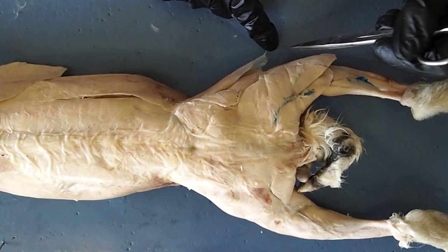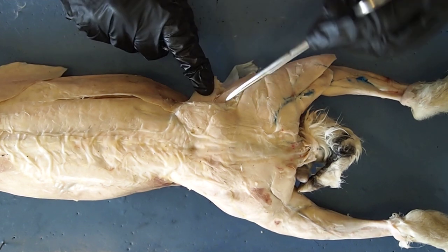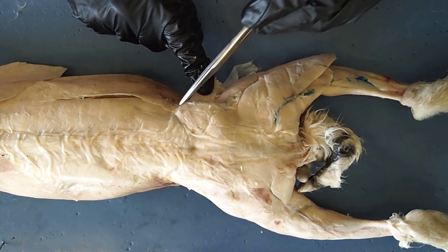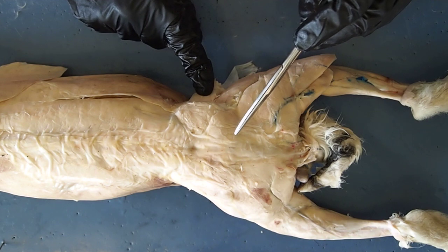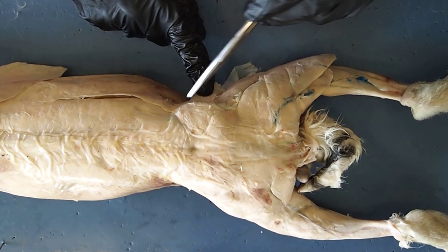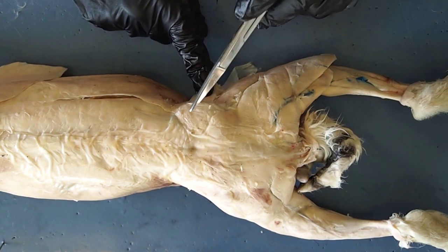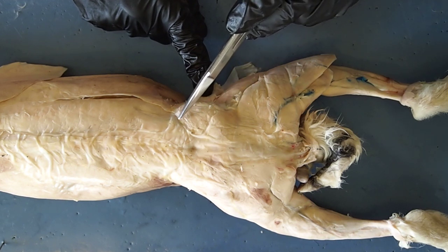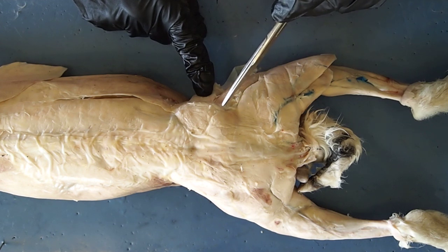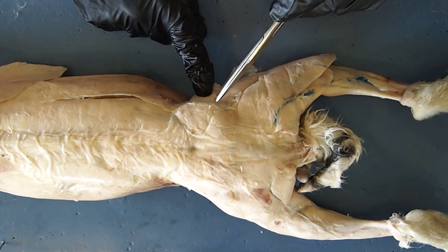Moving on down to the leg, we're going to look at a few muscles down here. This muscle right here is the gluteus. There are multiple muscles in that group, but we're just going to collectively call those the gluteus. There is actually the gluteus medius and the gluteus maximus, but for our test purposes, gluteus is going to be just fine. The gluteal muscles help to move your leg and also stabilize your hip when you're walking.